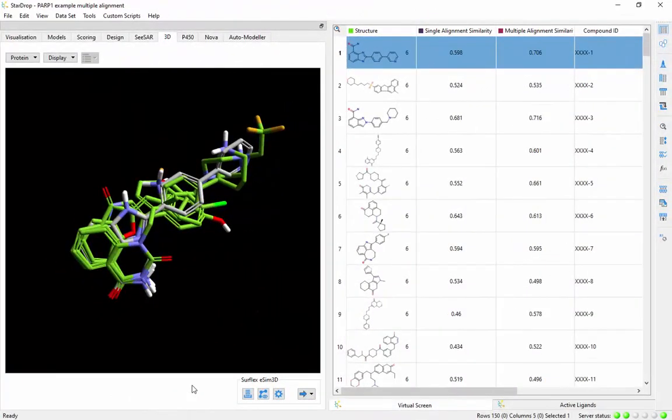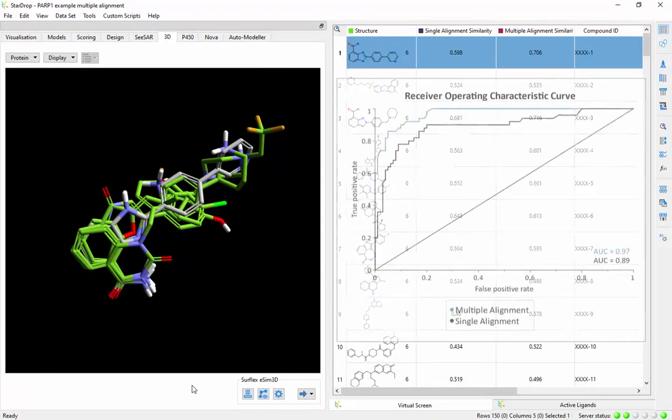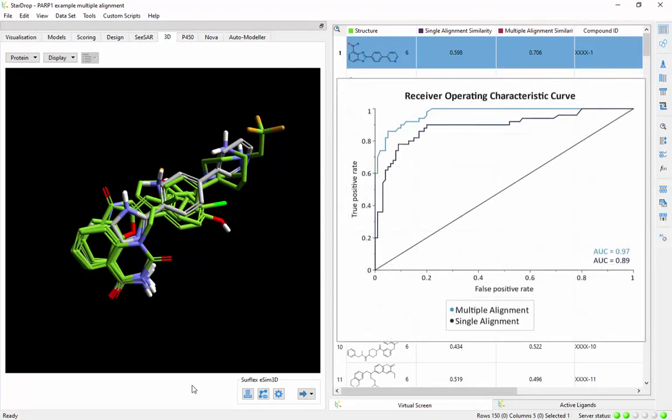Using a multi-ligand alignment as a target improves the robustness of virtual screening by taking into account the natural variability in ligand binding and protein conformation.